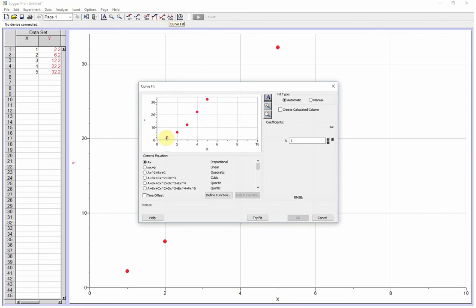And we can go in here and Vernier LogoPro will give us many different options. Generally, we're probably going to go with the quadratic fit.